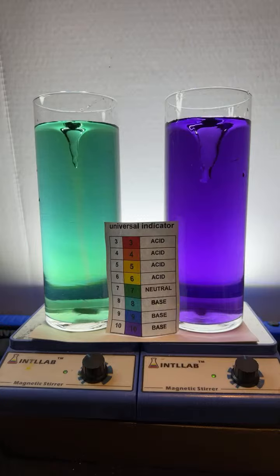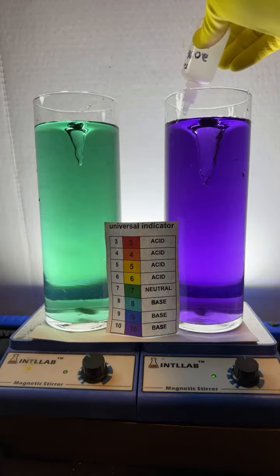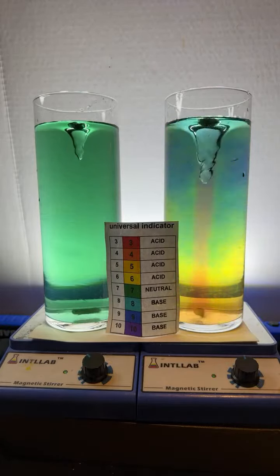I'm doing pretty good there, Simon. And I got your green. I got the green. Come on, baby. That's hard to get. All right, let's neutralize the base. I'm going to add some hydrochloric acid, the same acid that's found in your stomach, over here on the right. There goes 1 drop. See that red color? We got the whole rainbow, baby.